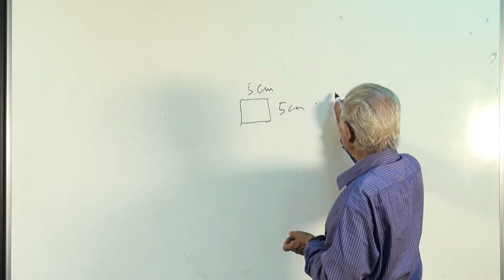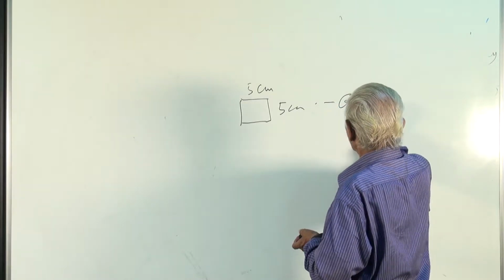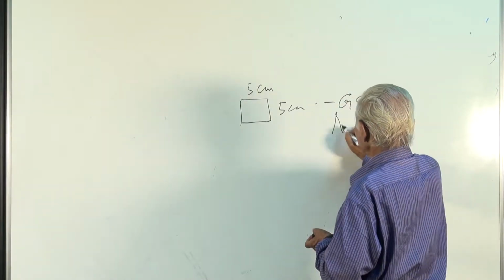First, the fabric is weighed to get the GSM or areal density as it is called.